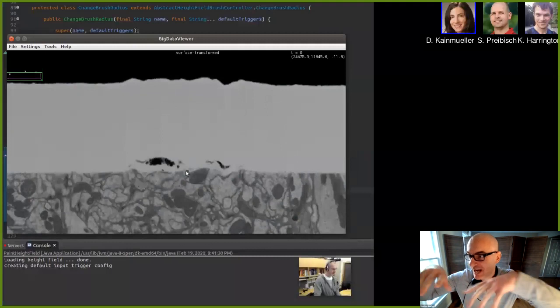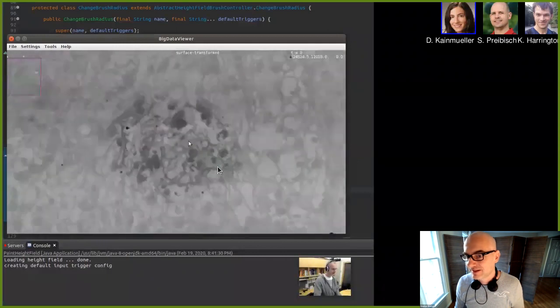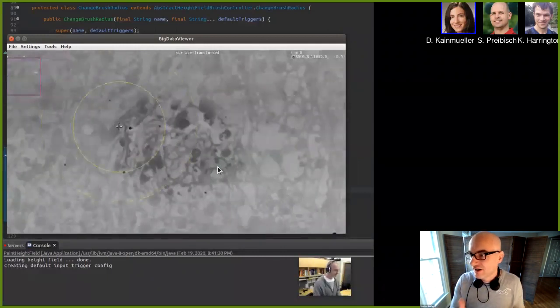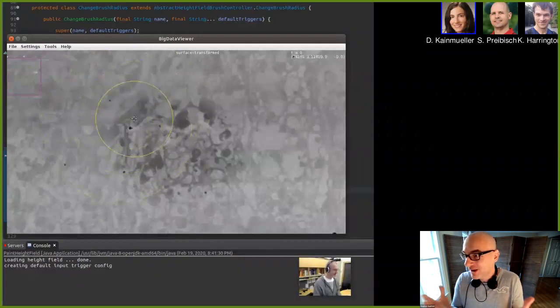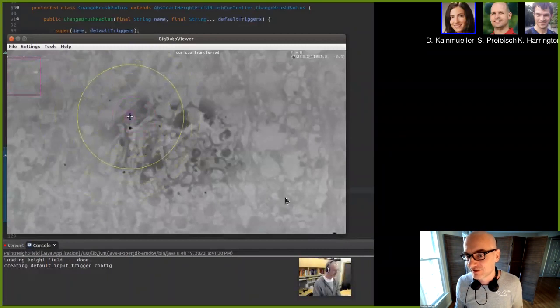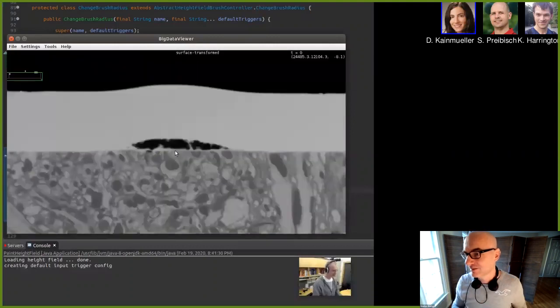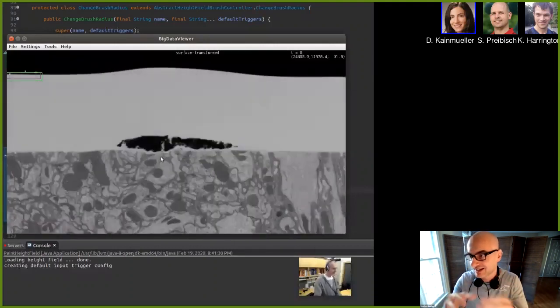And we can interactively paint into this and then save it and undo it and stuff like this, right? So the fact that we can all do this in real time on very large data sets turns out super helpful, and is the only way to address this, because if you do this on single images and you identify regions and stuff like this, you never get the precision, right? So what I'm having here is just a simple brush where I can push up and down this deformation field and can immediately see what the outcome of this is, and then I can polish it, I can make it more smooth, and then I can pull more and less, and I can change the size of the brush and all kinds of stuff, right?